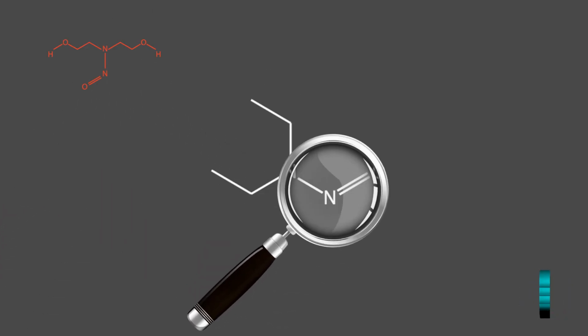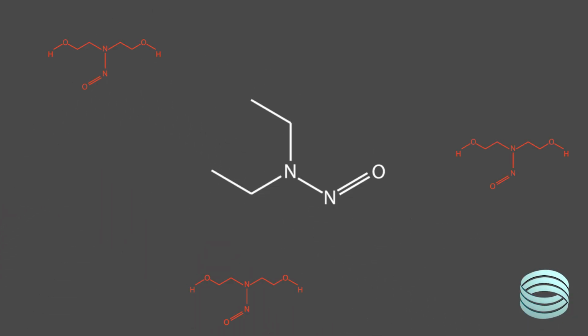With GC-MS-MS, if you weren't looking for it, it's as if that nitrosamine didn't exist. You never see it. This is the limitation of traditional nitrosamine testing. It's powerful, but it has tunnel vision. You're zoomed in so far that anything outside of your known targets remains invisible.